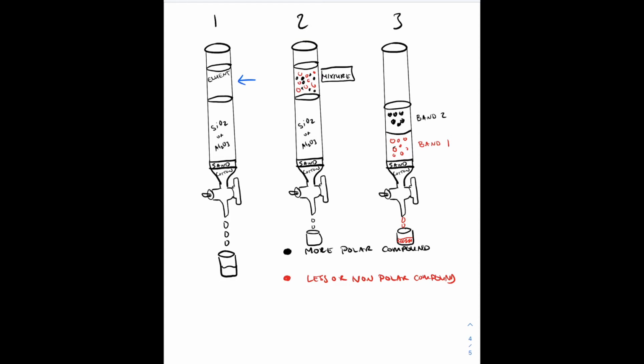Blue eluent, that's the solvent that we are using to desorb the organic material. And then we also have our solid material here. Generally a column chromatography is prepped in a giant tube, and we have sand here and then cotton here, as well as a stopcock that allows the liquids to drip out, and then we collect them in a little container of some sort, right?